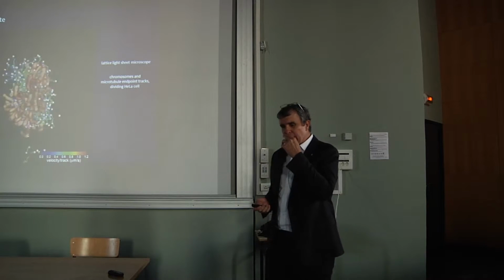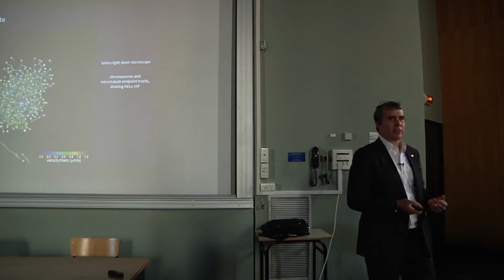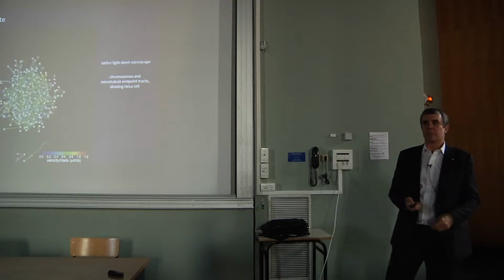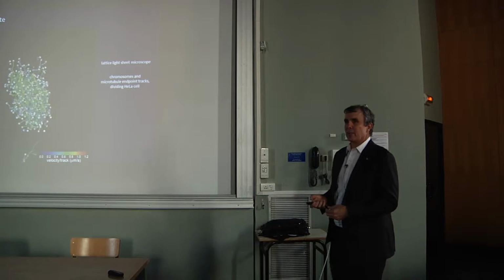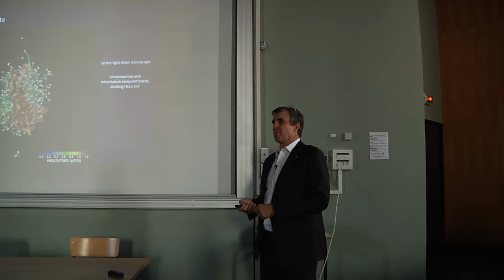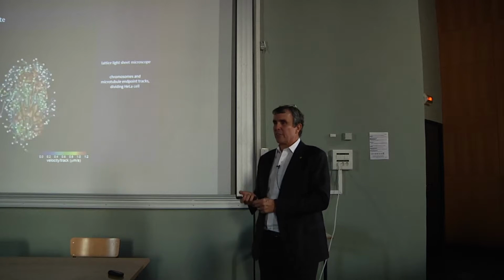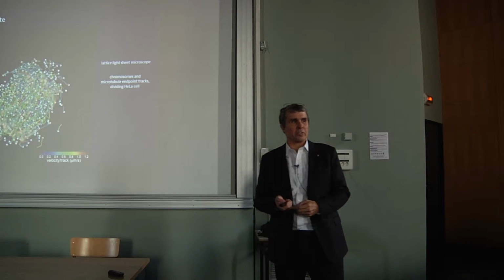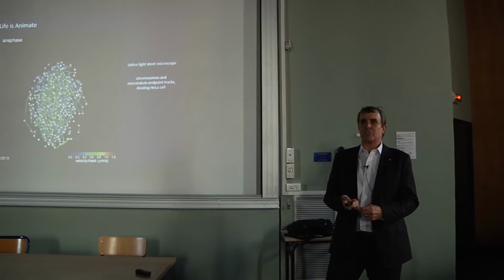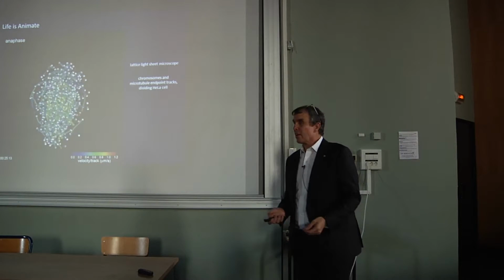So all of that is fine, but everything I've showed so far is on a fixed dead sample, okay? And about 98% of all of the results of super resolution microscopy have been on fixed dead samples. There's a lot of problems with that, among them that fixatives are known to affect the ultrastructure by their very nature, and so you're not really looking at something physiological to begin with.